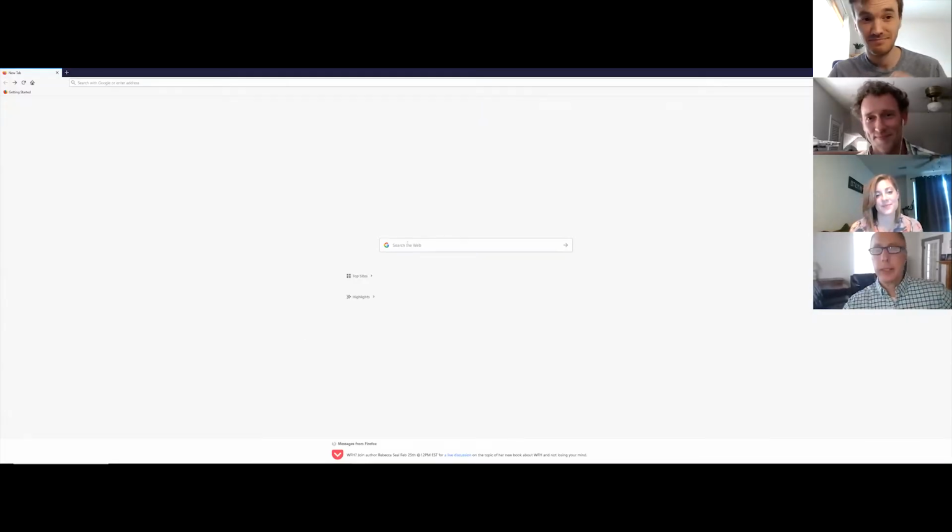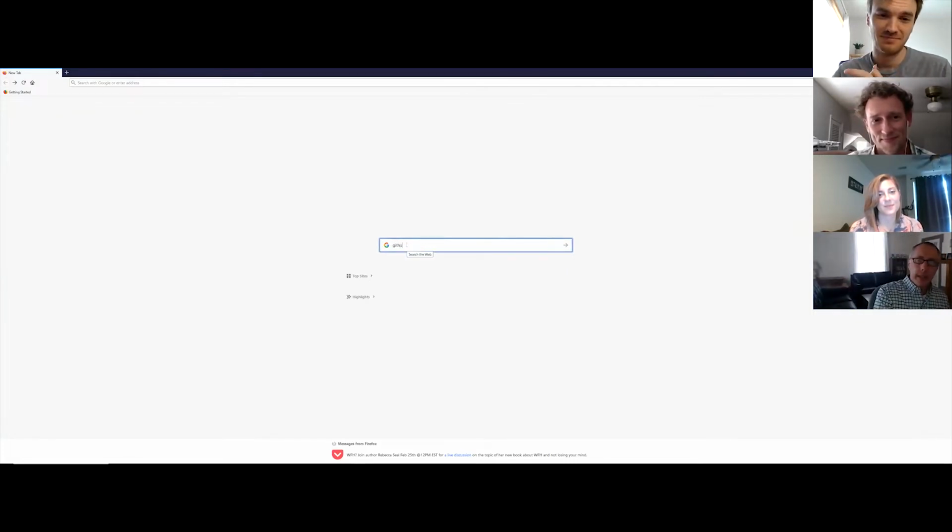So yeah, go ahead and chime in with any questions, but I'm gonna take over the screen now, and I'm gonna go to Google, and we're just gonna try it. Here is my search window, and I'm gonna type in GitHub MetaMorpheus.